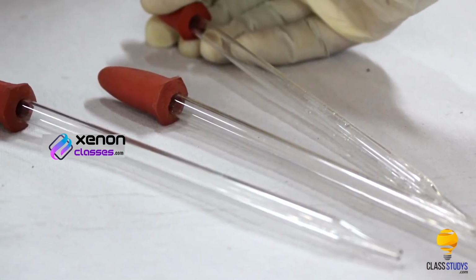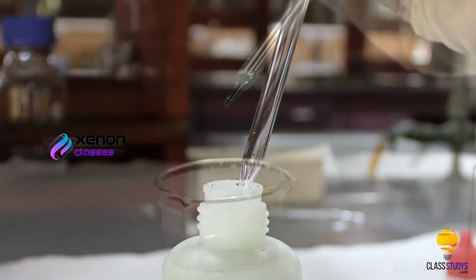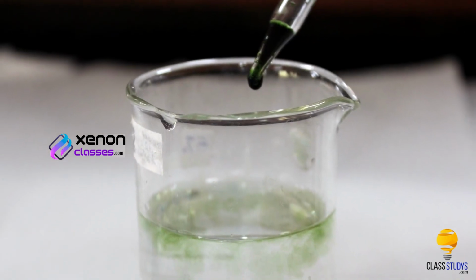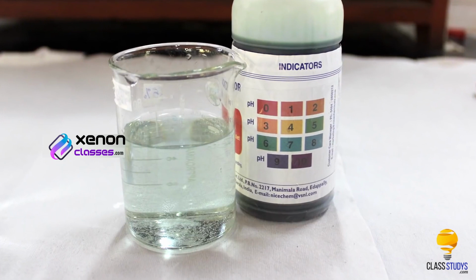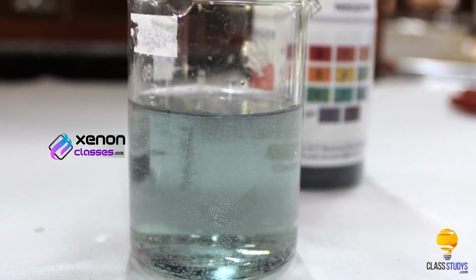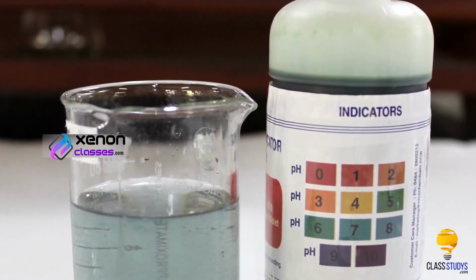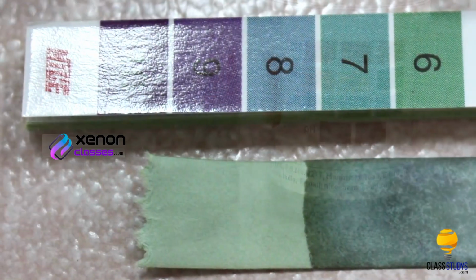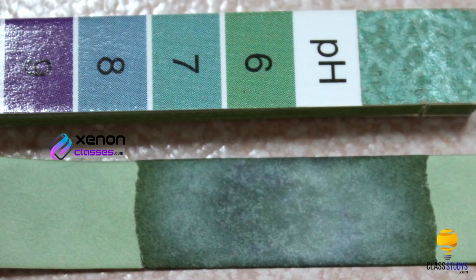Using a fresh dropper, take 1 drop of universal indicator solution and add it into the common salt solution taken in the beaker. Observe the color produced and compare it with different color shades of the indicators given on the universal indicator bottle and again find out the pH value of the solution. You can observe that in both the tests, the pH value of common salt is 7.